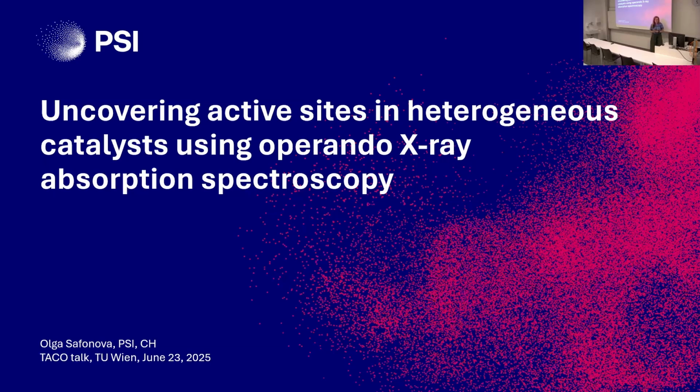So today my talk will be focused on heterogeneous catalysis and X-ray absorption spectroscopy. And the main idea of the talk is to convince you that X-ray absorption spectroscopy is quite a unique tool for uncovering active sites in heterogeneous catalysts. The beauty of this technique is in many senses, but in particular because you can uncover the structure and reactivity of active sites without any material or pressure gap. So this is a big advantage.